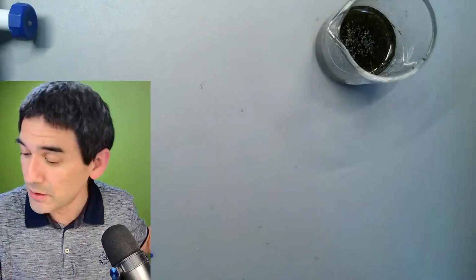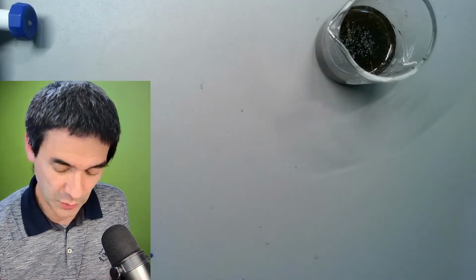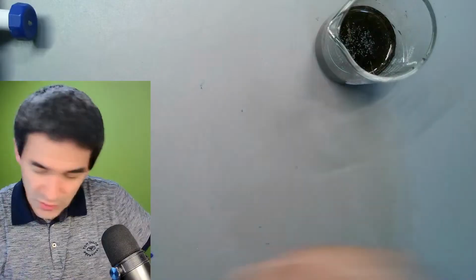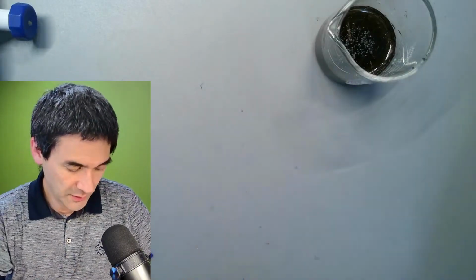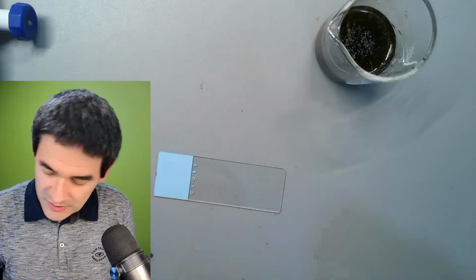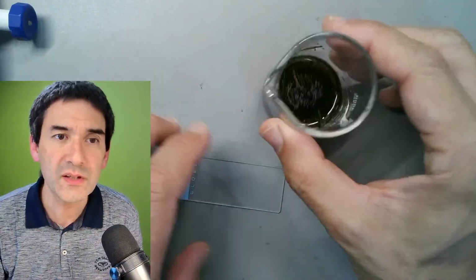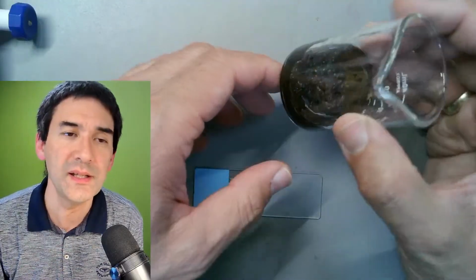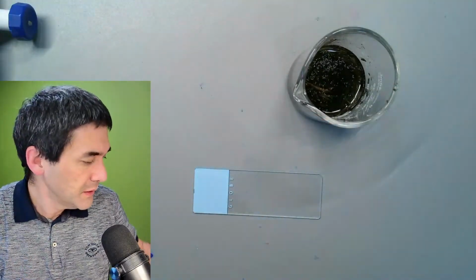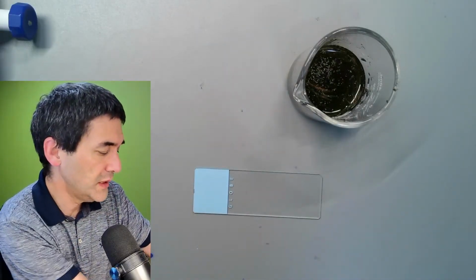And for this reason, I said, okay, why not just put a soil sample also under the microscope? Because I also want to demonstrate something to you. Maybe I can use the other slide over here. It doesn't really matter. I'm recycling those slides in any case. So what we have here, the big problem with any sample like this is, look, lots of particulate matter, and it's difficult to pick up sometimes. So what I'm usually doing is the following.